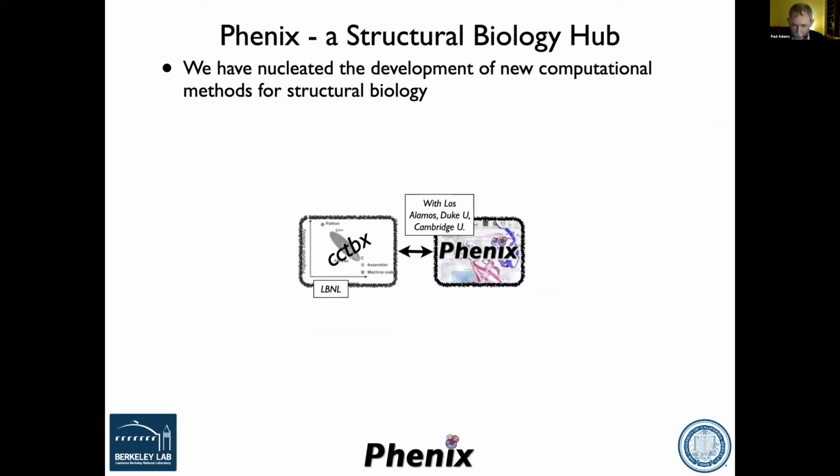So we started developing Phenix 20 years ago now, and that seems like a very long time ago. And we started off trying to develop Phenix as a new platform for crystallography, actually, really, and that's the topic of today and tomorrow. And it's built on top of an open source library.